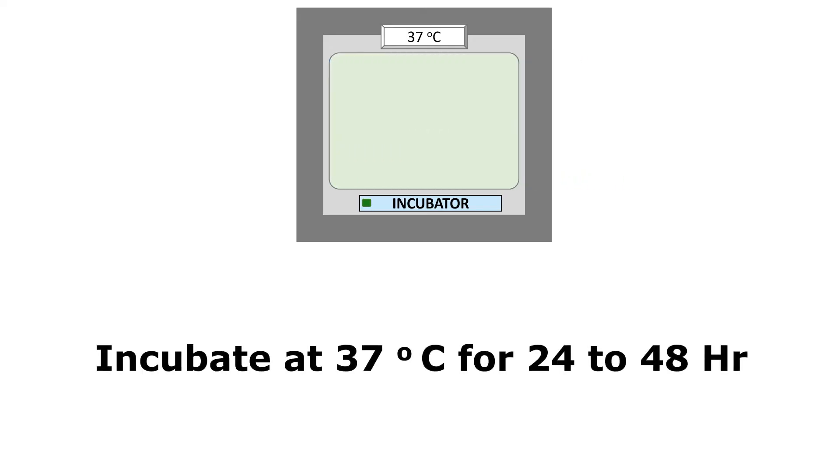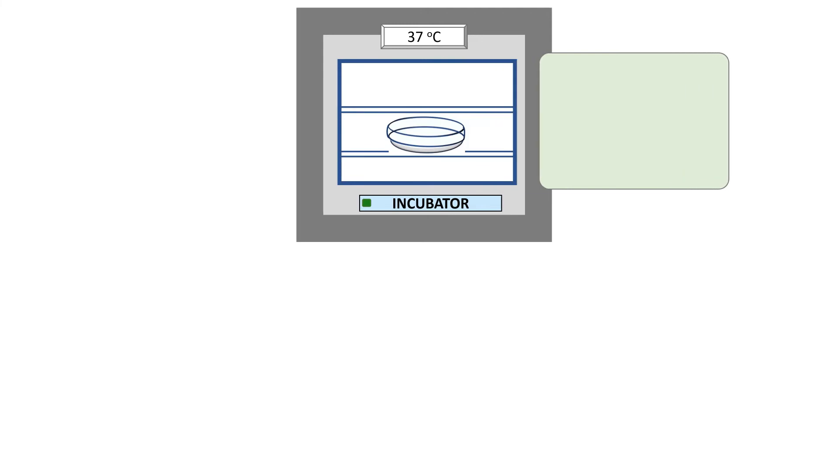After 48 hours of incubation, remove the plate from the incubator and check the growth of bacteria on the plate.